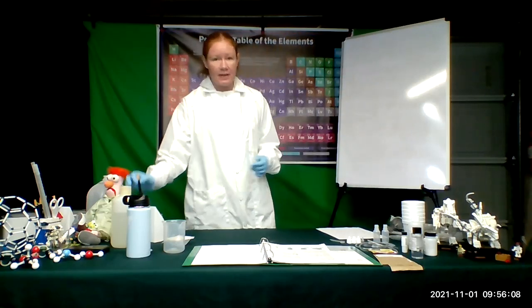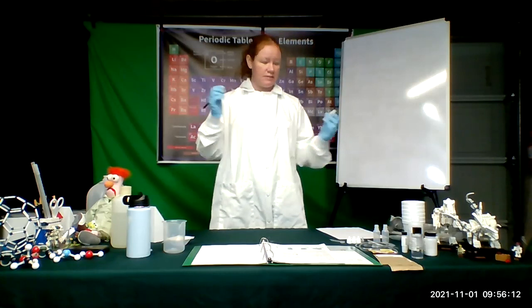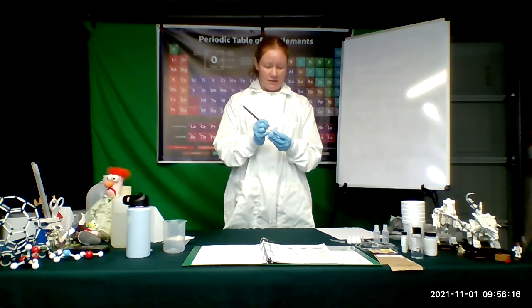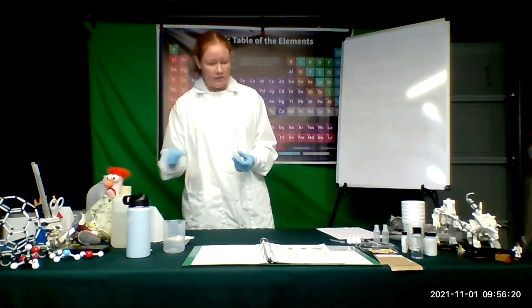So with a grease pencil, we're going to label our bottles. We need to label glucose, sucrose, and lactose. Since I'm just doing the sucrose, I'm just going to put an S on here for sucrose, so I remember that I am using sucrose.